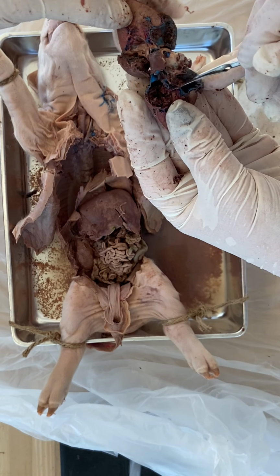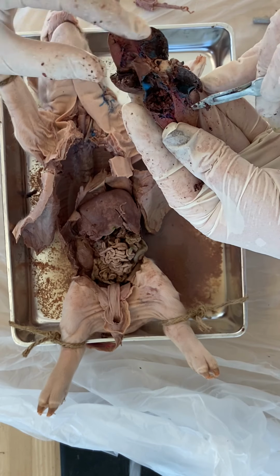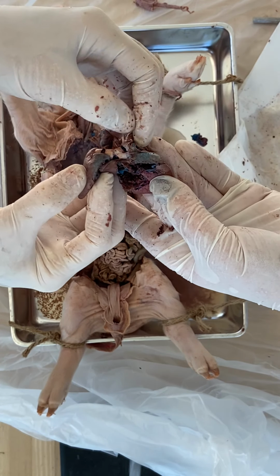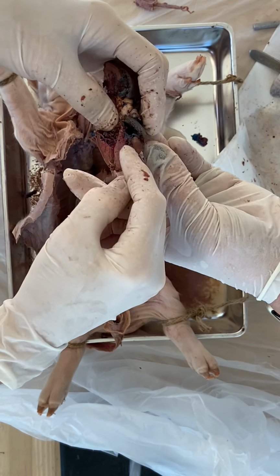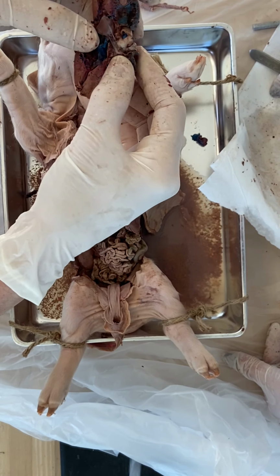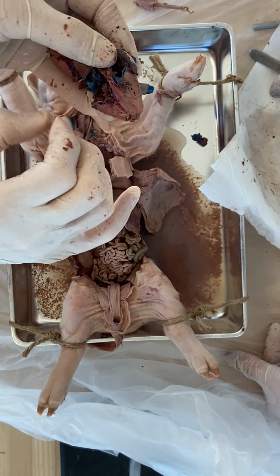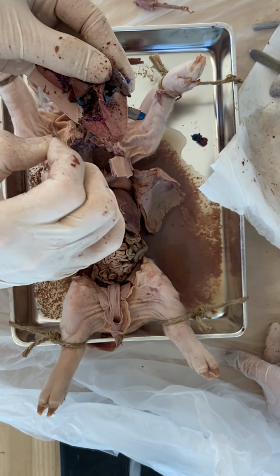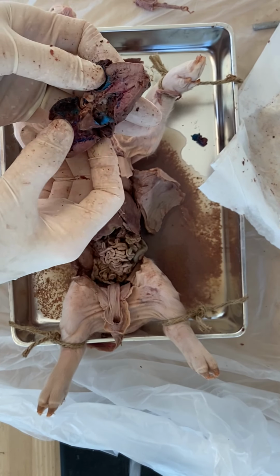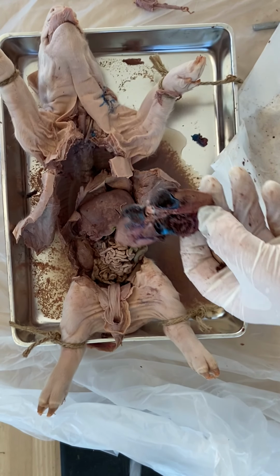I think it's very dry in here, isn't it? This is all very dry. Usually the valve is way up high, trying to see even going into the pulmonary artery. What do you think? Can you see a valve looking up in there? Like right there? Maybe? Yeah, that might be.